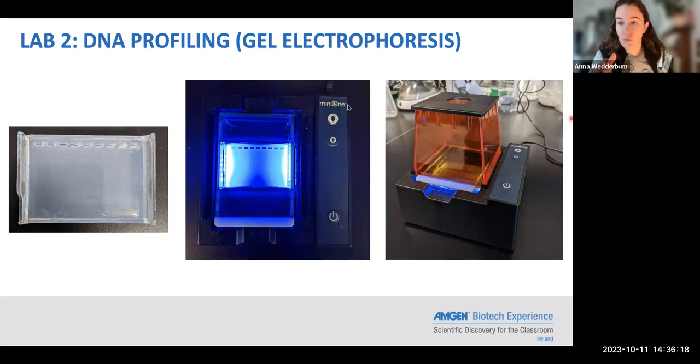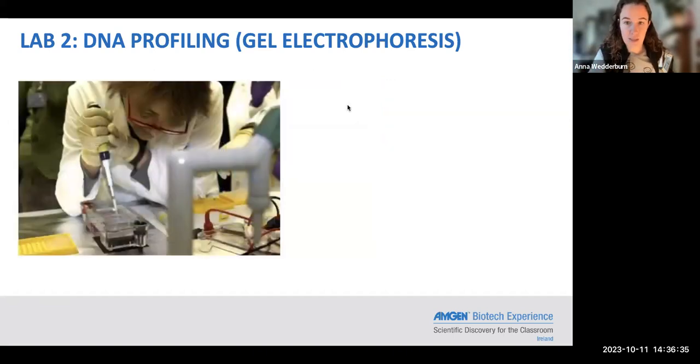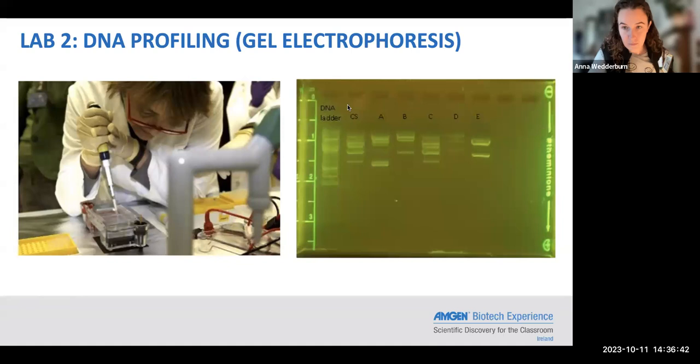There's no way that they can electrocute themselves, because the orange hood needs to be on for the electricity to actually run through it. And there's no ethidium bromide or anything like that, which is a carcinogen, which is what you normally need to run gel electrophoresis. But there's none of that in this. Everything is totally safe. So you run that. Once it's on, you run it for 20 minutes. And this is what the results tend to look like.